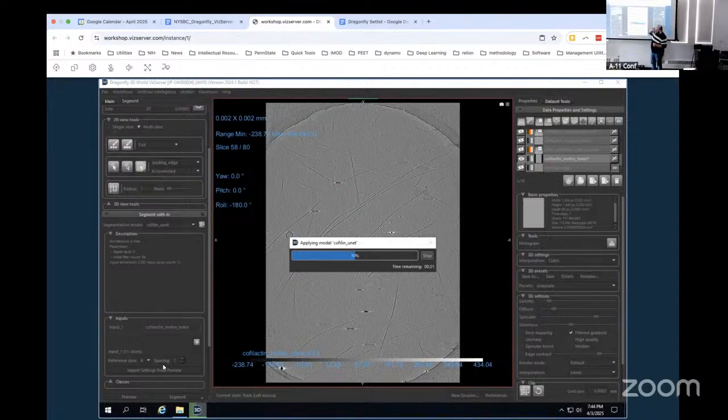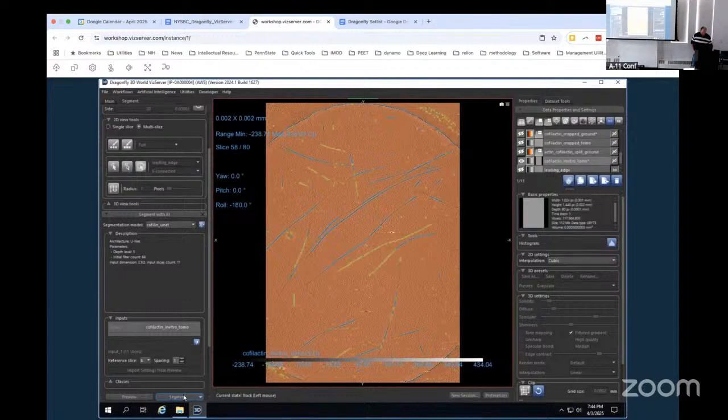So if you just want to check how that model works, you can just press that button. It won't go through them all. No, it's not perfect for sure. It's not good at all, actually.